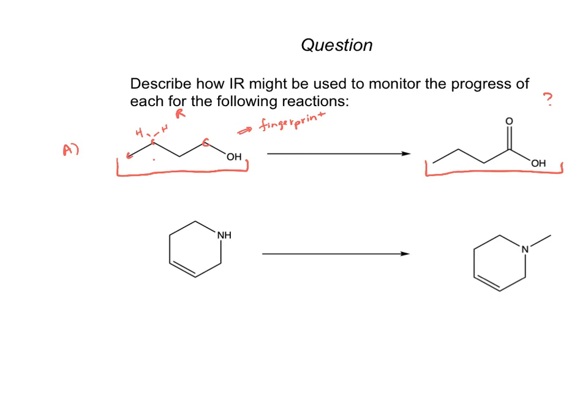We will see these carbon-hydrogen bonds in the diagnostic region, but each of these is an sp3 hybridized carbon attached to a hydrogen. So we're just going to get a bunch of junk in that 2900 inverse centimeters region of the spectrum. For the most part, these carbon-hydrogen bonds on sp3 hybridized carbons, we're not going to be able to utilize to help us determine structure. So we will expect something in this region, but it's not going to be super indicative of anything.